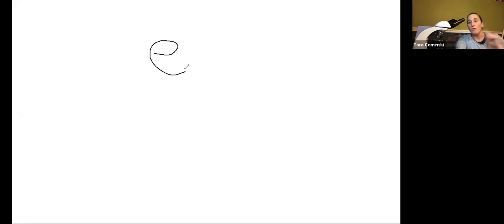All right, now I'm going to go back to the video and I'm going to do number 4 and number 5. It says move the slide to the right, move the slide to the left, and tell me what you guys notice. So I'm going to be manually moving the stage. Let me stop this share.